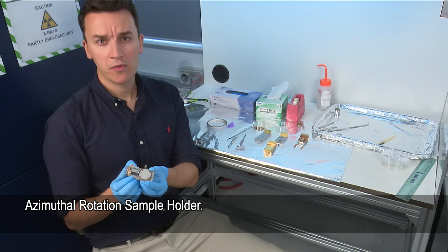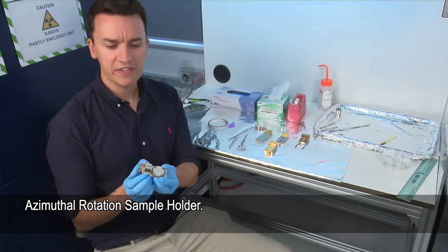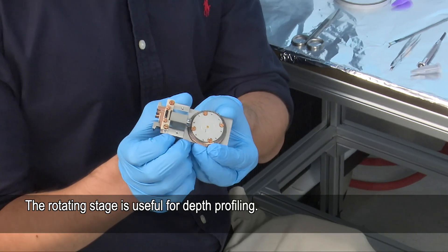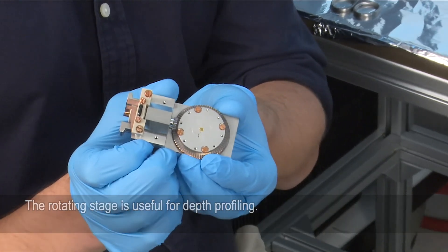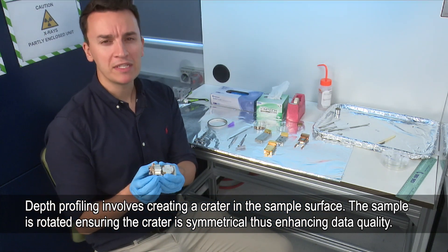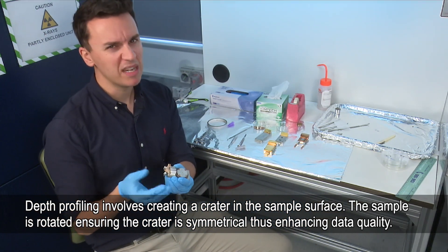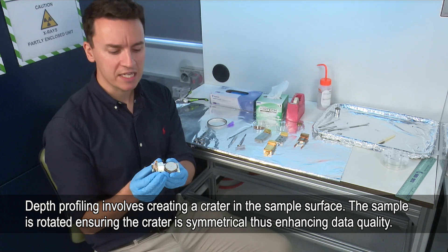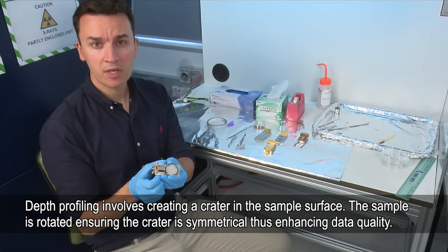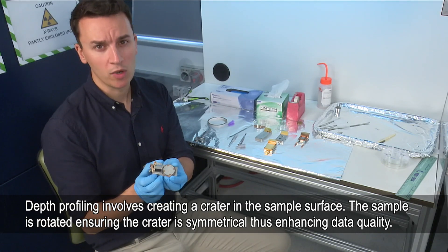This is the azimuthal sample holder — it's different to the others as it has a rotating stage. That's useful for doing depth profiles: we put the sample in the middle and when we do the depth profile we make a crater. If we didn't rotate it the crater could be a bit lopsided, but with rotation this ensures the crater is completely symmetrical, which improves the data quality we get.